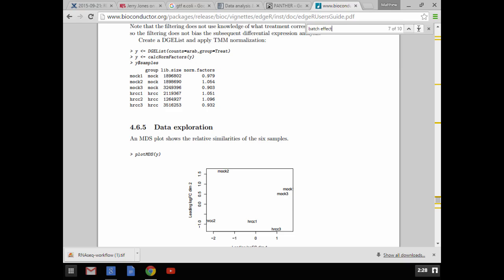The amount of time it will take EdgeR to run is almost only related to the number of genes in your sample and the number of actual samples that you have. So it's always going to be faster to run than anything else. So really, you could script it to run everything together as another submission job and walk away, but you're going to be better off running it as a single test at the very end of your run and doing it all manually.